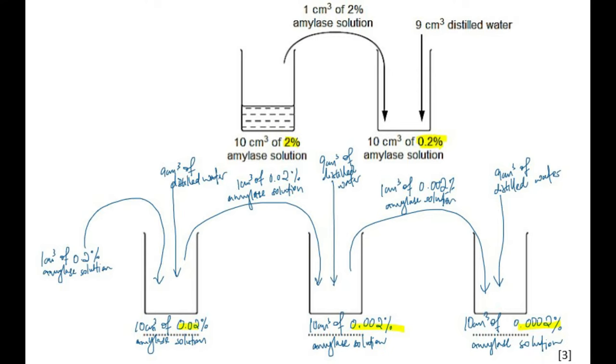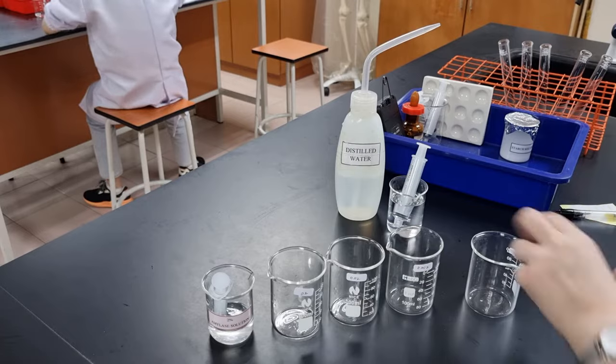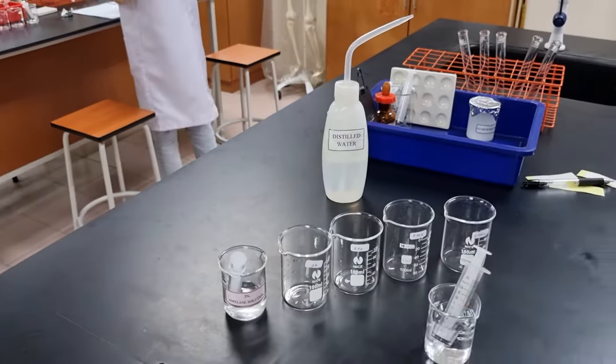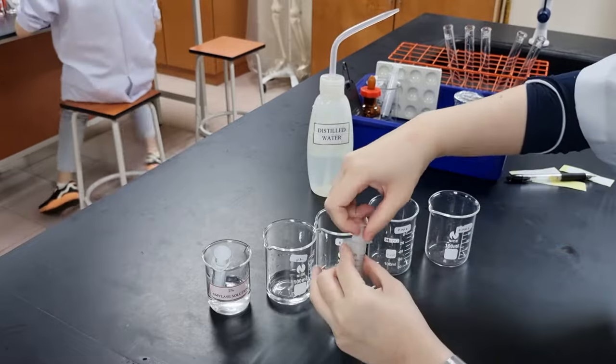First of all, don't forget to label the beakers. We have 2%, 0.2%, 0.02%, 0.002%, and 0.0002%.